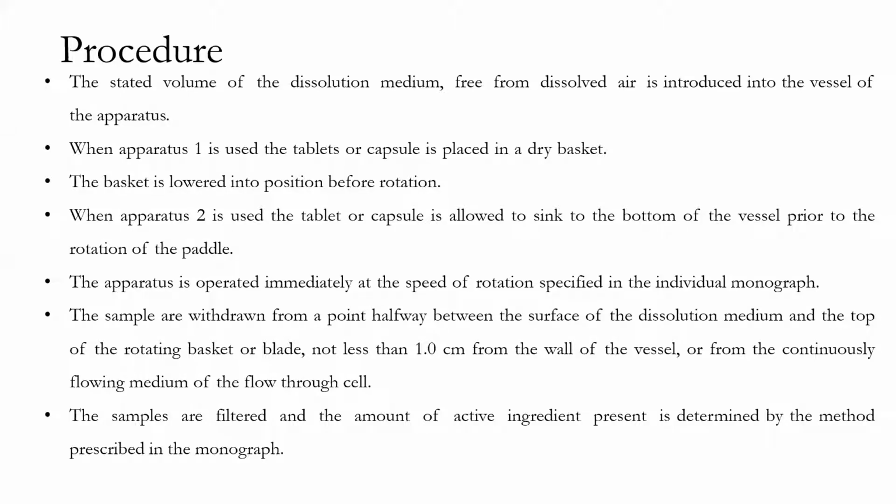So in this case, you learned how the dissolution test apparatus is run and what conditions we need to maintain. The media, whatever we are going to use, should be free from dissolved air. The apparatus should be made of inert material wherever it comes in contact with the media. So here you can see this is glass only.